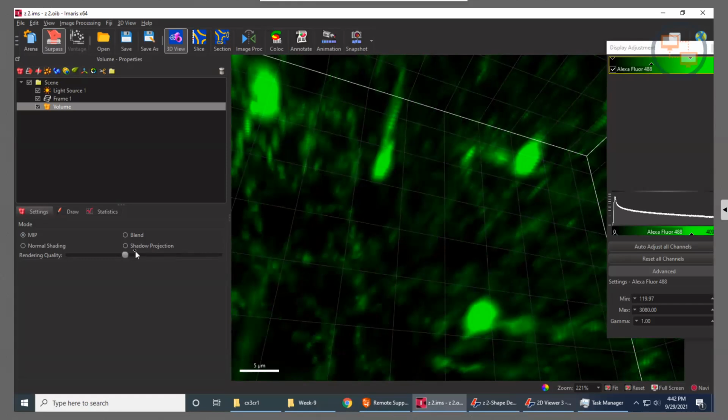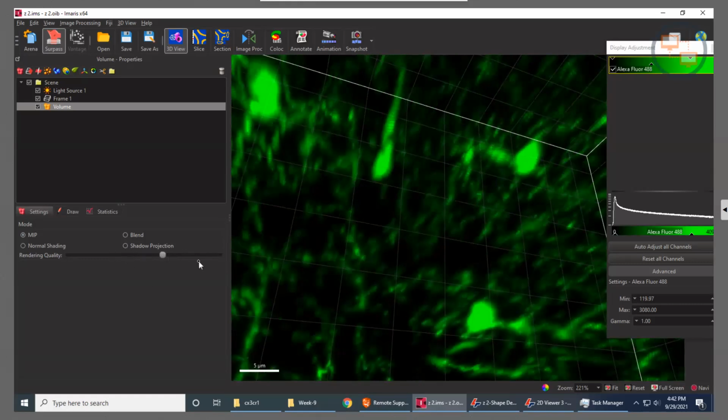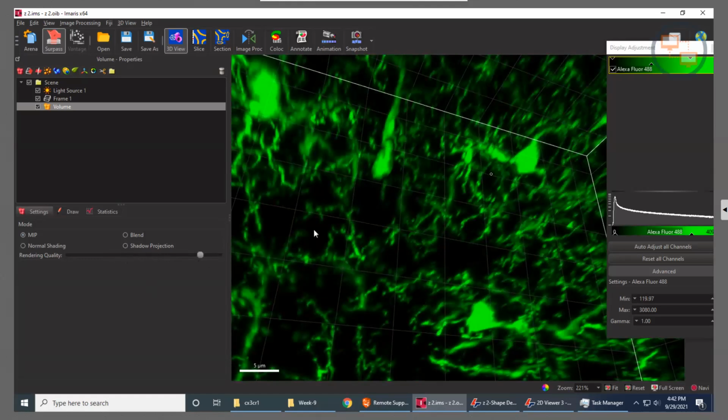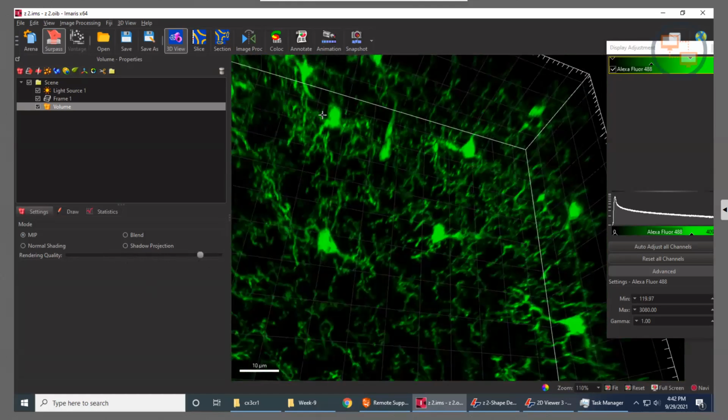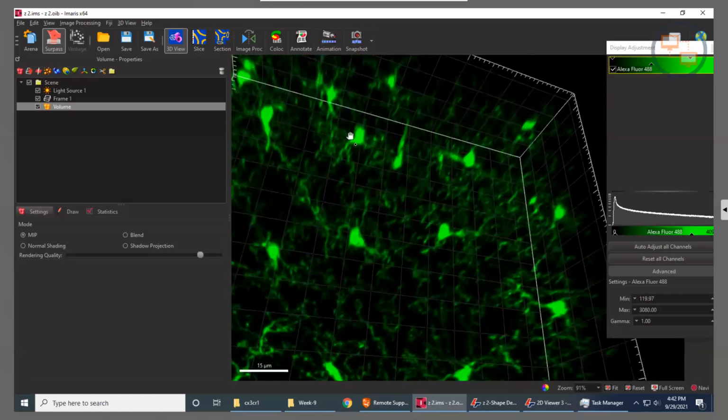As you can see now, it's important to note that while it looks messier and less good as data, this is only changing what you see on your screen. It's not actually altering the data that the software is looking at. So this would be a superficial change. The analysis could still carry on underneath.